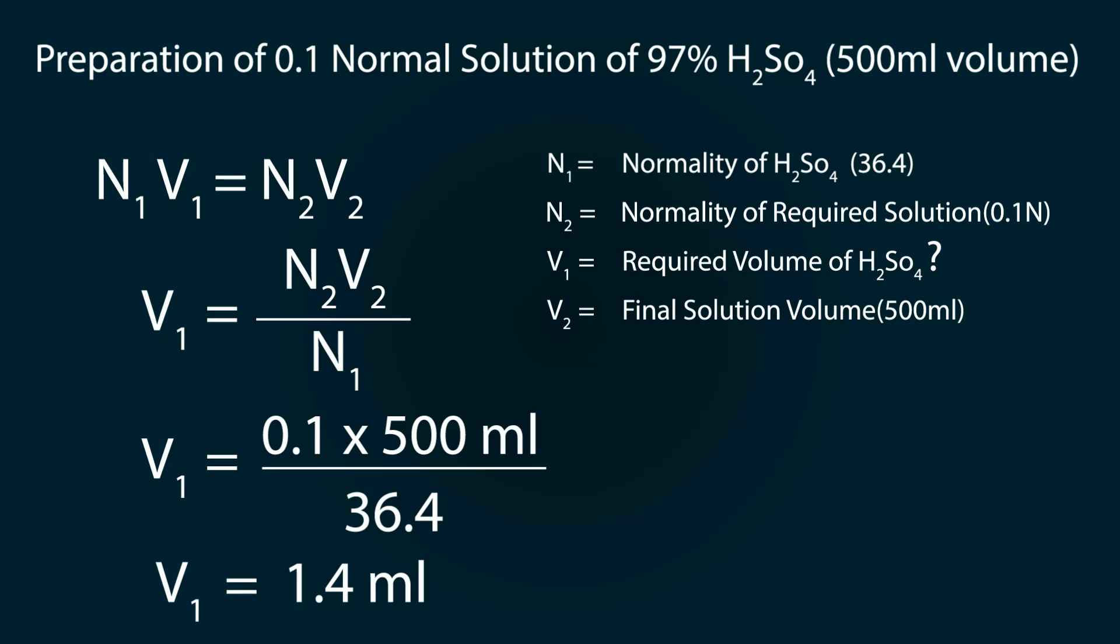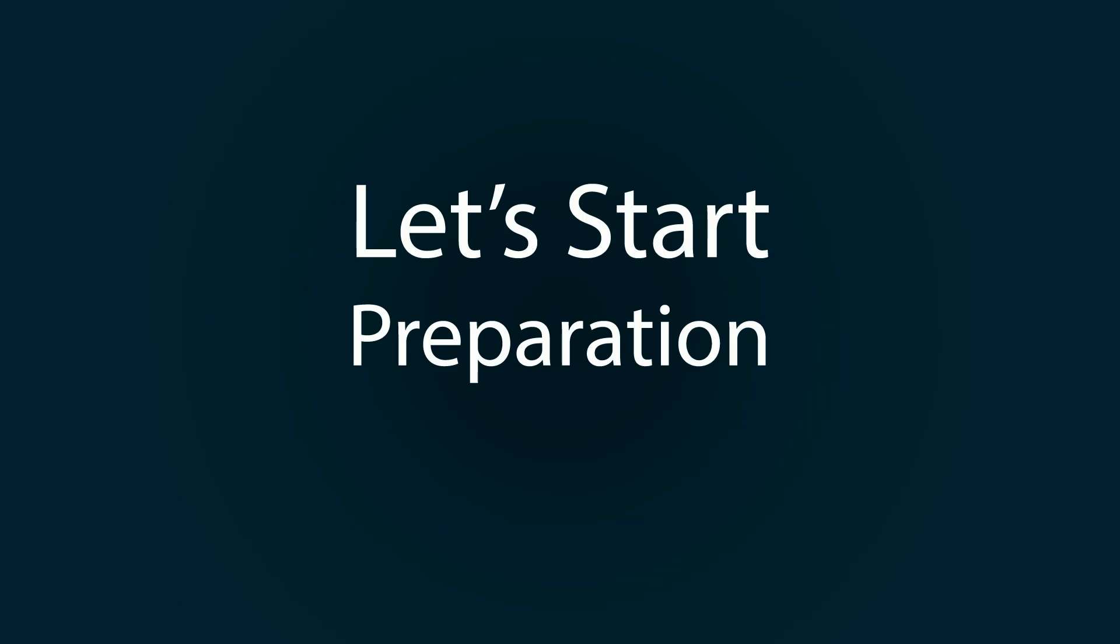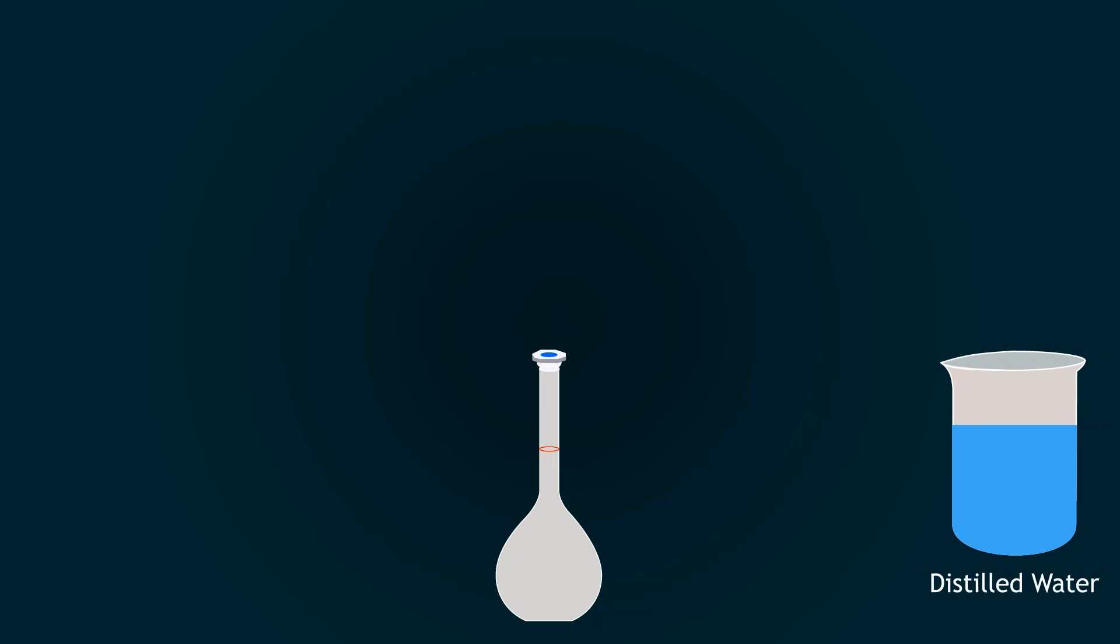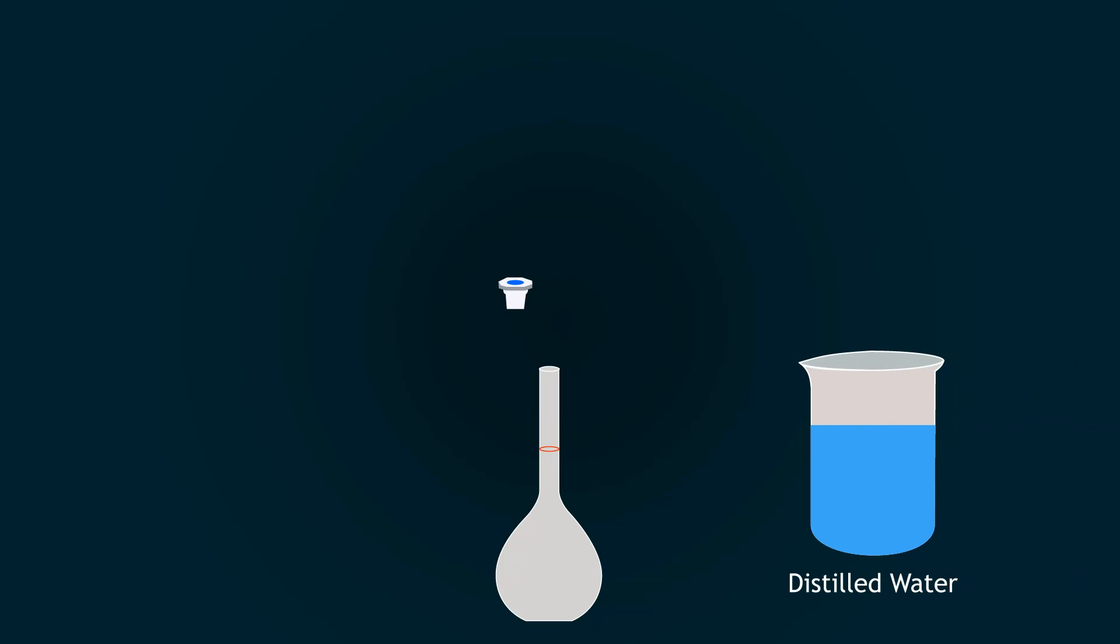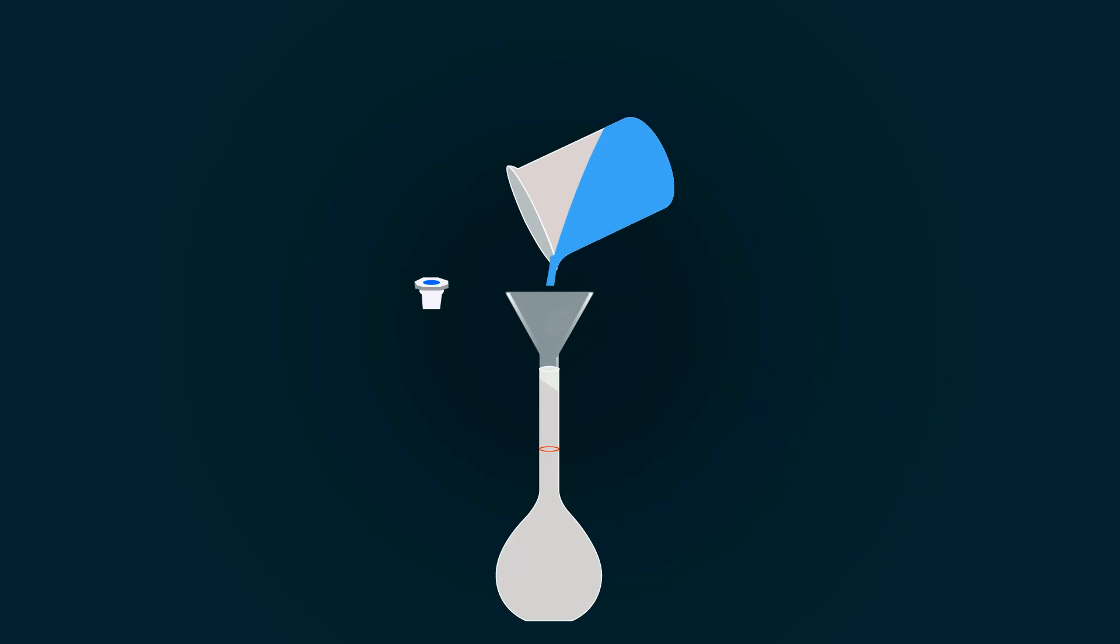Let's start the preparation. Take a measuring flask and add some distilled water with a funnel. This small addition is for your own security so you're not harmed while using sulfuric acid.